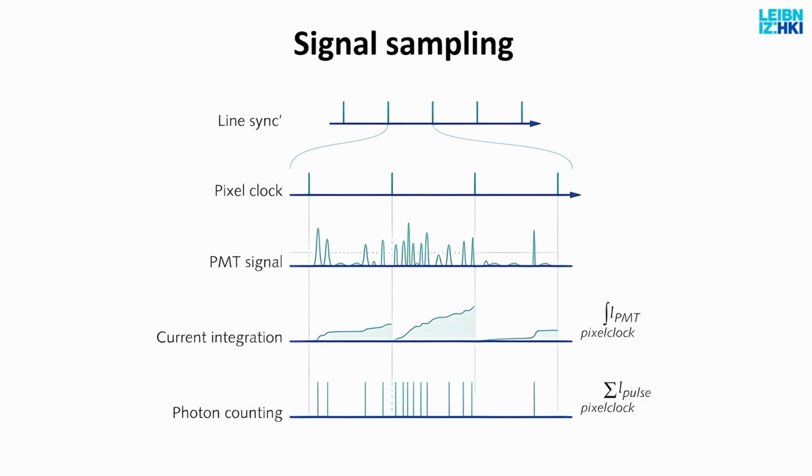As I get more and more electrons, my integrated signal goes up, and the area under this curve is my fluorescence intensity in a confocal microscope. So this pixel is less bright than this one, but this pixel is much brighter than that one. And this interval for how long I integrate is the so-called dwell time, which determines how large the pixel is.